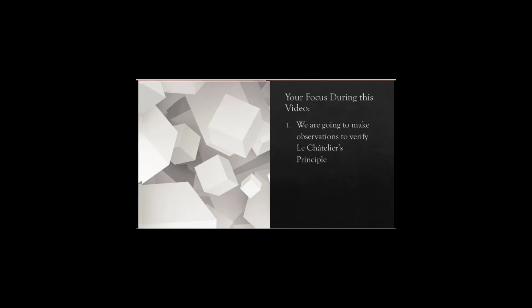All right, in today's lab, we're going to look at Le Chatelier's principle. So you're going to want to turn to Lab 5 in your lab book. And what we're going to really focus on during this video is making observations. This report, the write-up, is going to focus on a little introduction, and then you're going to write a really good set of observations with results and conclusions.